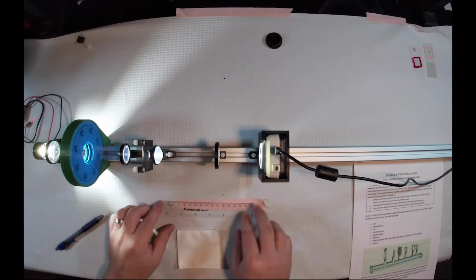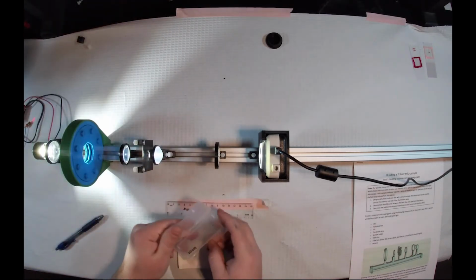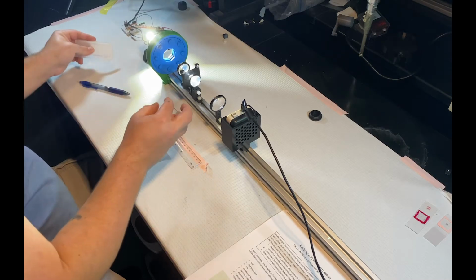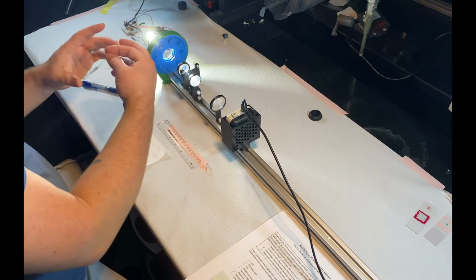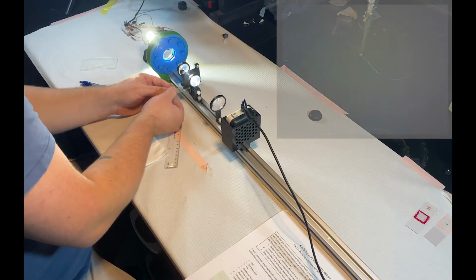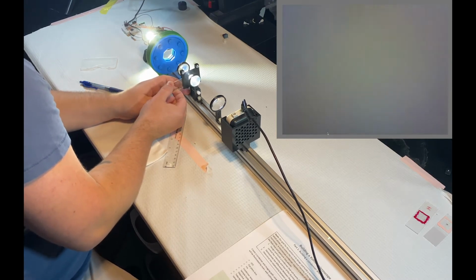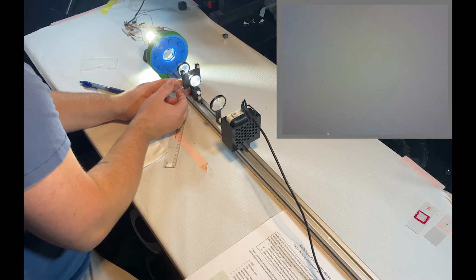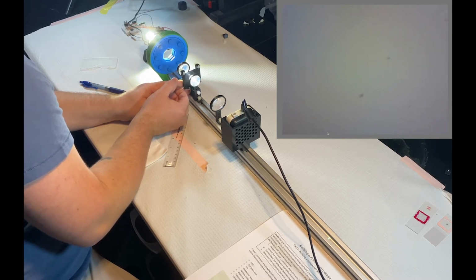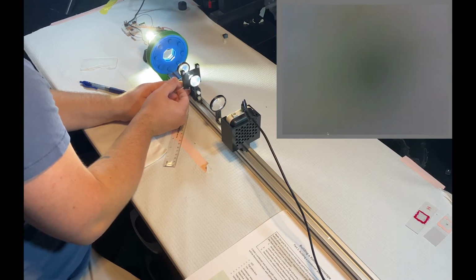I'm not going to be using the ruler today. I'm going to be using this calibration slide that we used in the last lab. Not for any sort of calibration because we should know what the magnification is, just to get a nice sharp image in our focal plane. So I'm just going to slide that in there and just going to be sort of looking for where anything starts to appear in my field of view. And I'm starting to see something there.